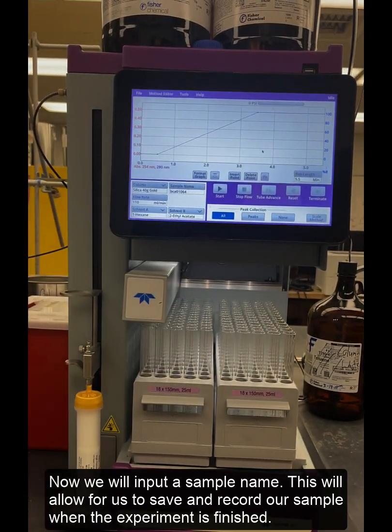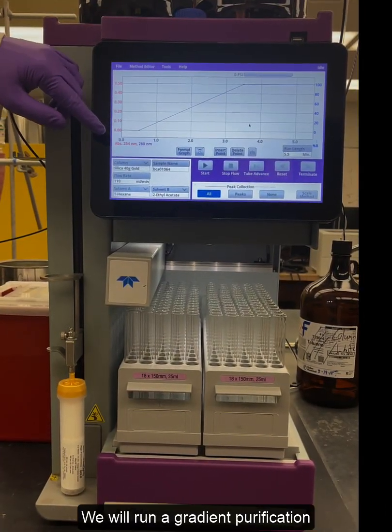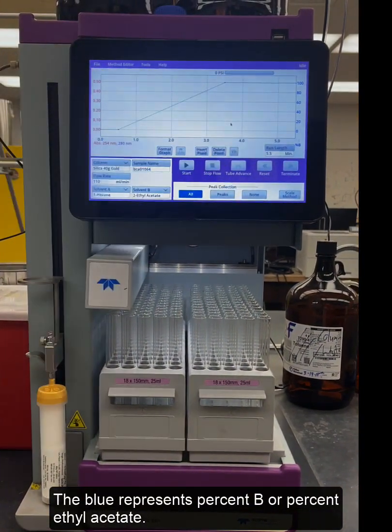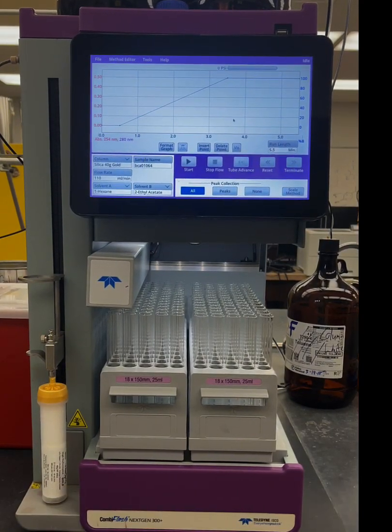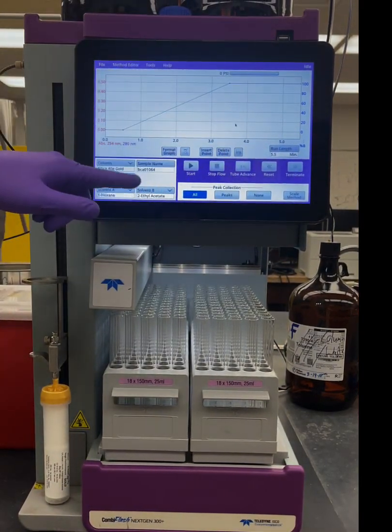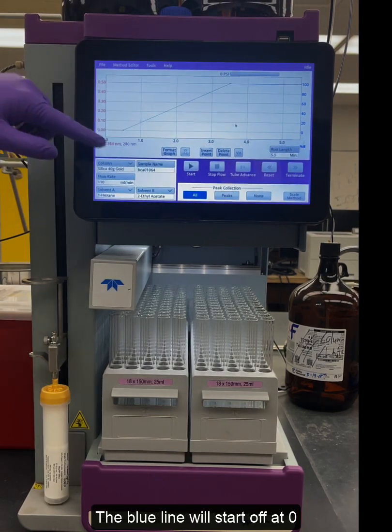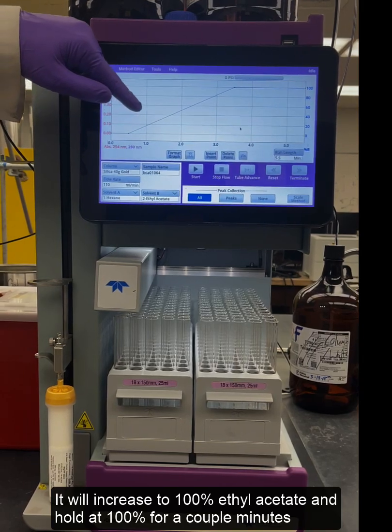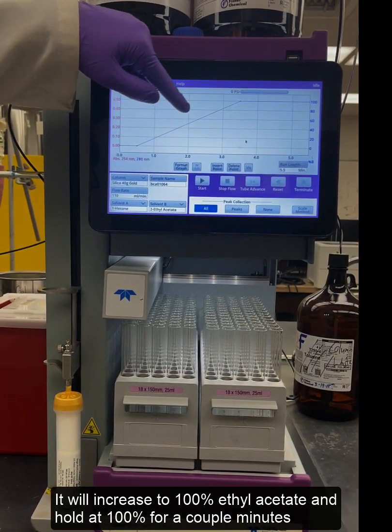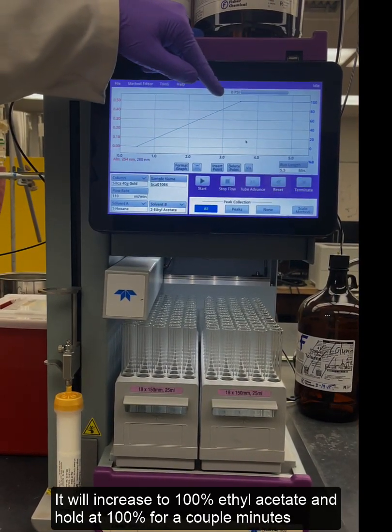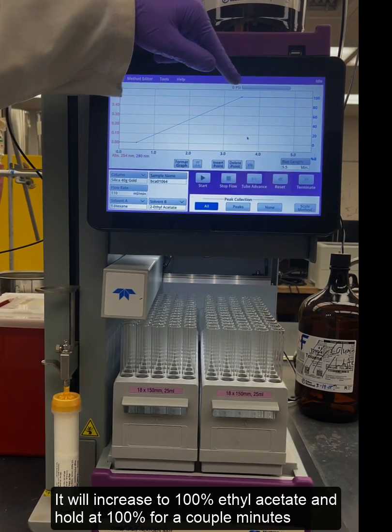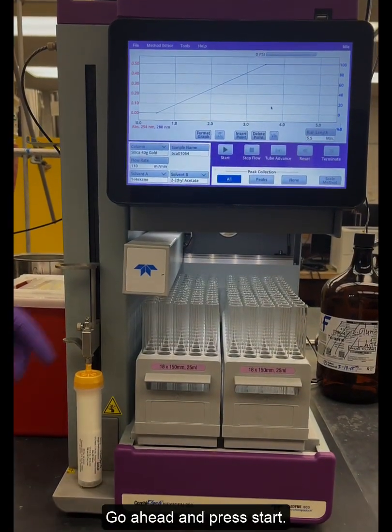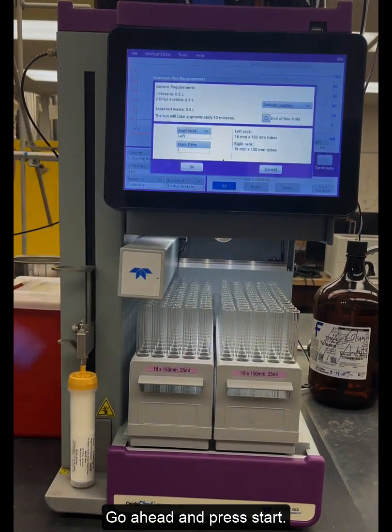On a gradient purification, the blue is percent B or percent ethyl acetate. The blue line will start off at zero and will increase to 100% ethyl acetate and hold at 100% for a couple of minutes, which should theoretically give us a good separation. Go ahead and press start.